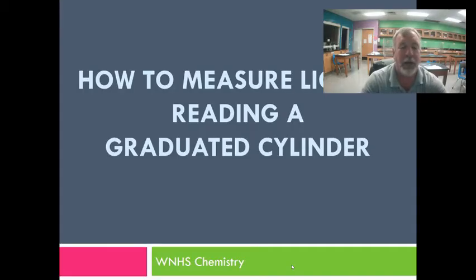Hello, class. These are the notes for Tuesday, September 8th for chemistry class. Today, we're going to talk about how to measure things, how to measure the volumes of liquids, and how to measure the mass of some substances.